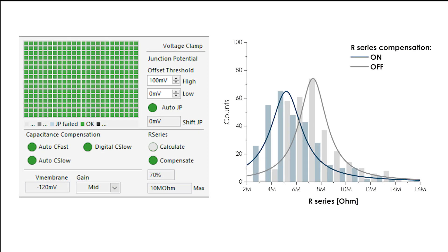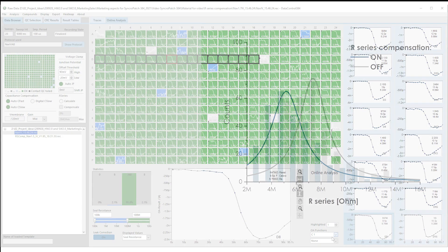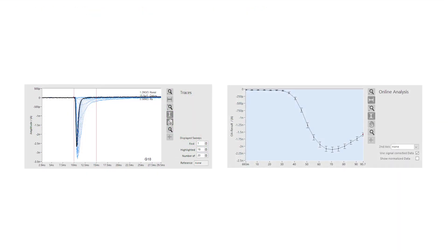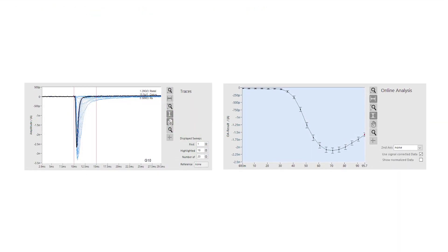The new Syncopatch 384 is our simplest, most efficient and reliable automated patch clamp system to date.